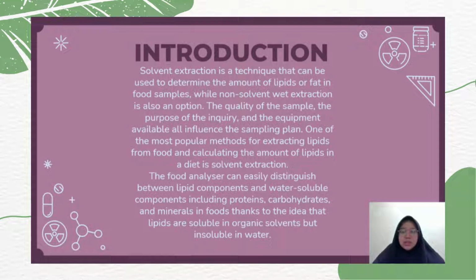Okay, so for the introduction, what is a Soxhlet analysis? Soxhlet analysis is a technique that can be used to determine the amount of lipid or fat in a food sample, while non-solvent wet extraction is also an option. The quality of the sample, the purpose of the inquiry, and the equipment available all influence the sampling plans.